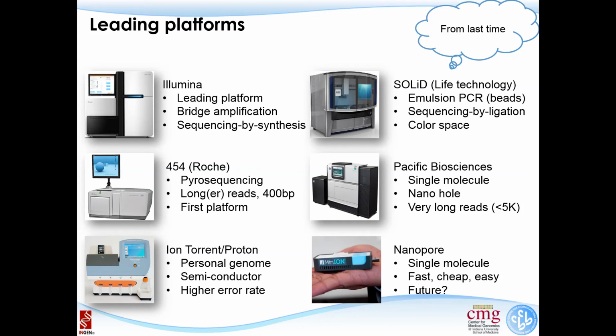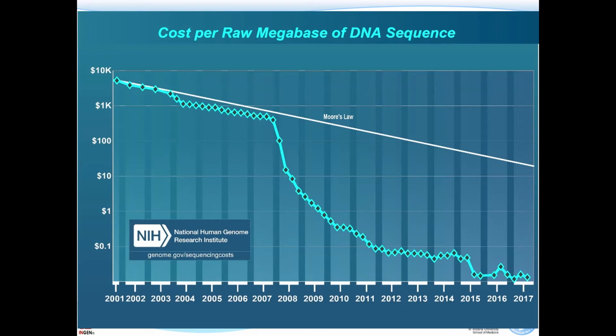Because A, C, G, T all have different sizes, by measuring how much electrical disturbance the nucleotide causes, you will be able to figure out what the sequences are. And of course, this is a very portable instrument that has a lot of implications in some parts of the world.